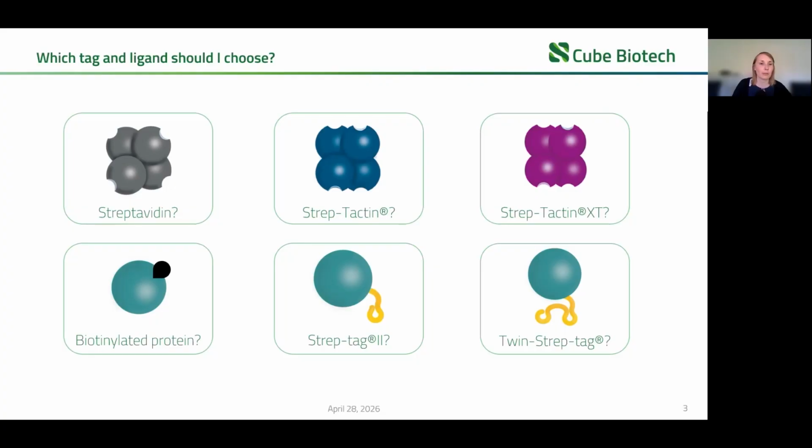The reason why I'm addressing this topic today is because we noticed this with our customers, but we also got the feedback from Gator that there's often confusion around the streptavidin, Strep-Tactin, and Strep-Tactin XT systems, especially what is what and what can I use with which ligand. So I hope I can clarify this for you today. And so after this webinar, you know exactly which tag ligand combination you can use for what application.